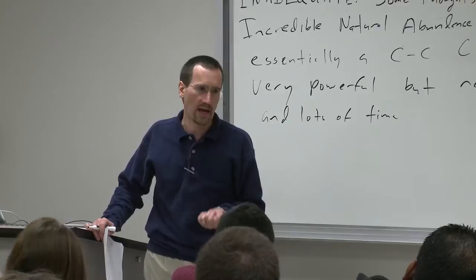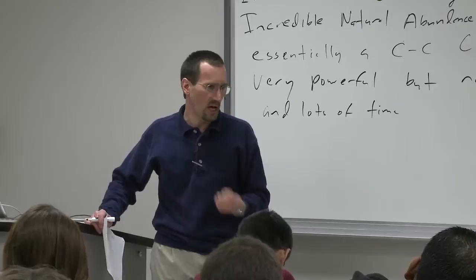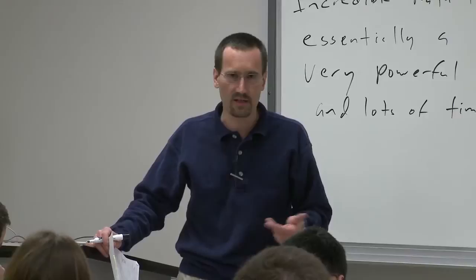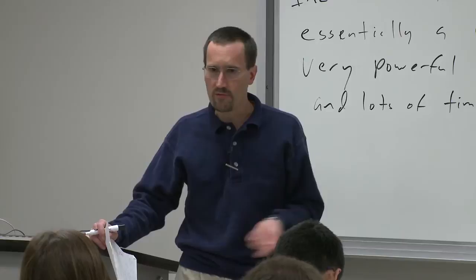If, on the other hand, you have some side product in a reaction and you think this is key to optimizing a reaction, maybe not a late stage intermediate in a synthesis, but maybe in a methods project and you're trying to suppress something, and you can get yourself 100 mgs and you just can't get a handle on it any other way, this may be a way.